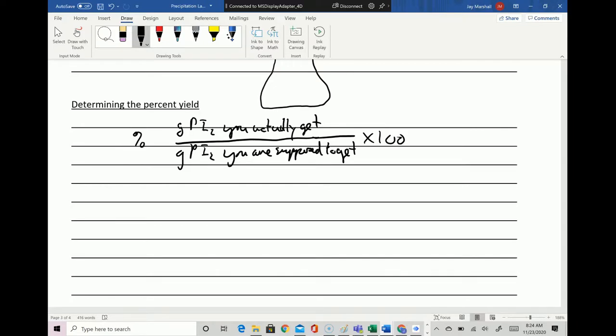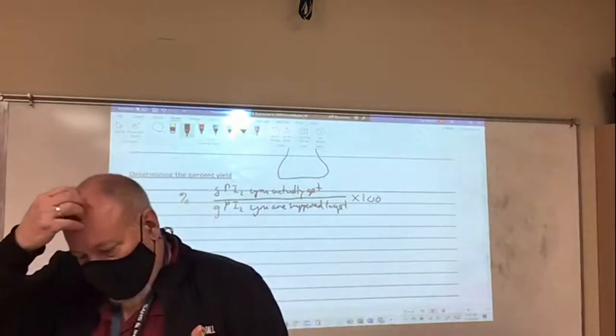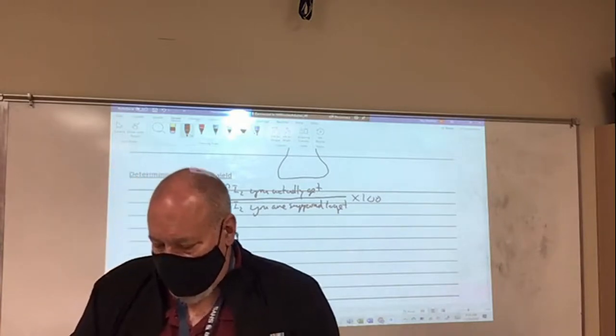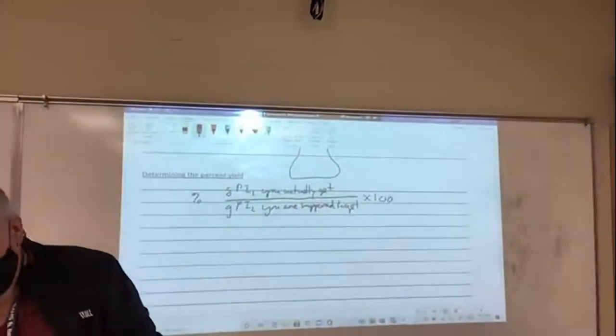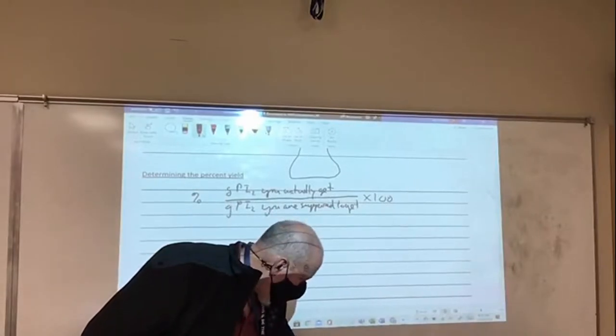procedure. Okay, again, as you're doing this, write notes. You've got the basic outline of the procedure, but write notes about how you're doing it so that we can come to class next time and create an actual full-on procedure and maybe write up a conclusion at the same time as well. Okay? So that's how we're going to accomplish this. Yeah. Sorry.